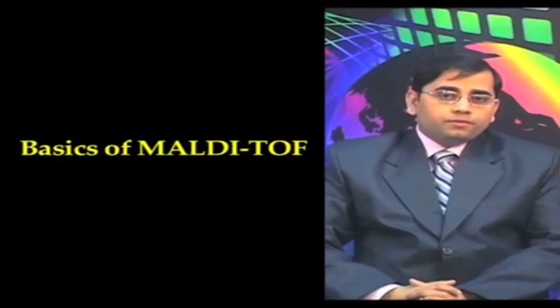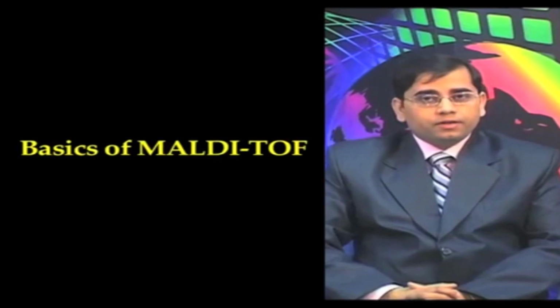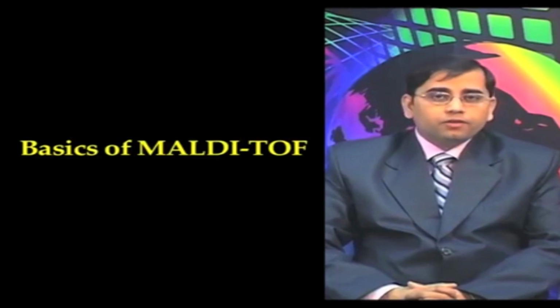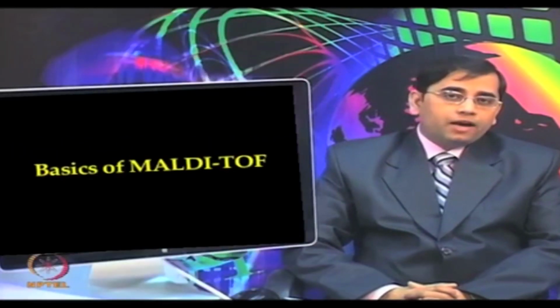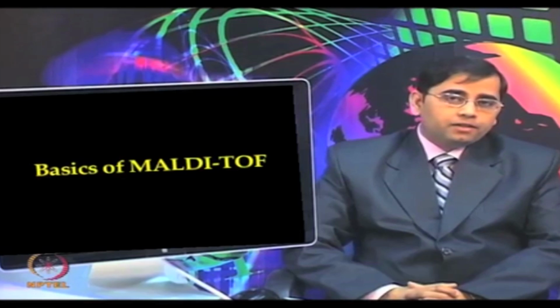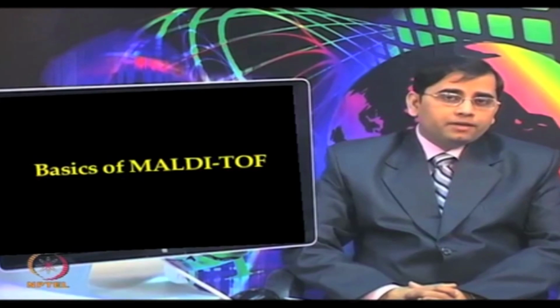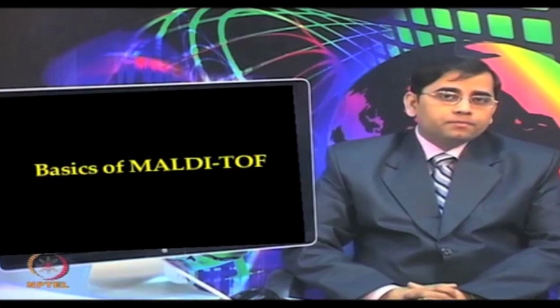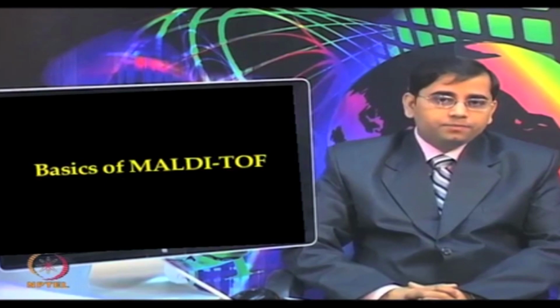Let us first start with the basics of MALDI TOF. So, MALDI is an efficient process for generating gas phase ions of peptides and proteins for mass spectrometric detection. MALDI is one of the most widely used ionization techniques currently applicable in the proteomics area. This ionization method was independently developed by two scientists, Koichi Tanaka and Hillenkamp. Tanaka also received the Nobel Prize for his novel contribution to soft ionization techniques such as MALDI.